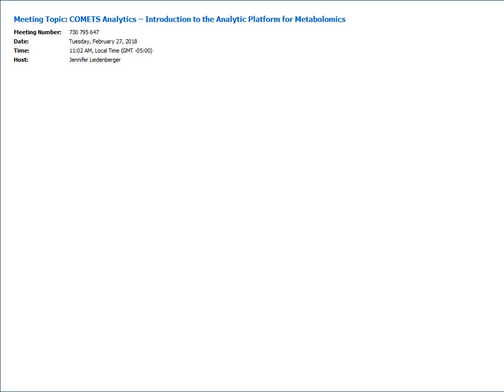By identified, of course, different labs use different identifiers or different names, which can make it a little challenging. So we collected from each lab a sample spreadsheet to see how much metadata they include and how we can link across.